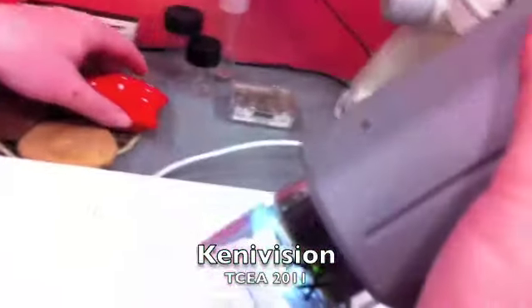And the touch tube, what this does is whenever it's off stand, makes it a little bit easier for the microscope to actually see. Okay, so what we're looking at there is a piece of wood, right? And then here's what it looks like. And what magnification are we looking at there? That's 20x right now. But with the simple twist of this right here, I can go up to 40. Now we're up to 40x.